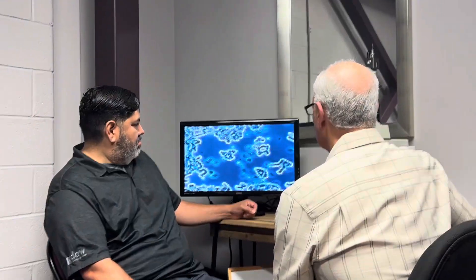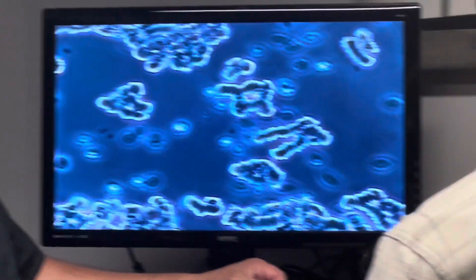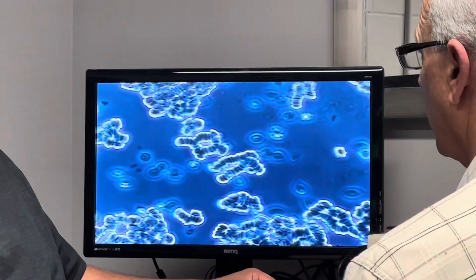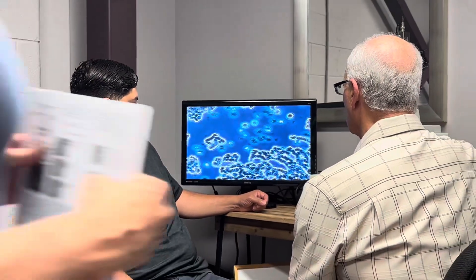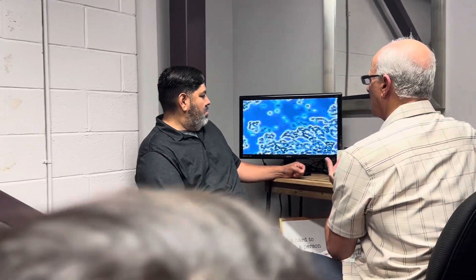The reason we do this is it's investigatory and not diagnostic, so the labs are diagnostic. But lots of times, many times when we're looking at this, it correlates beautifully to the labs.